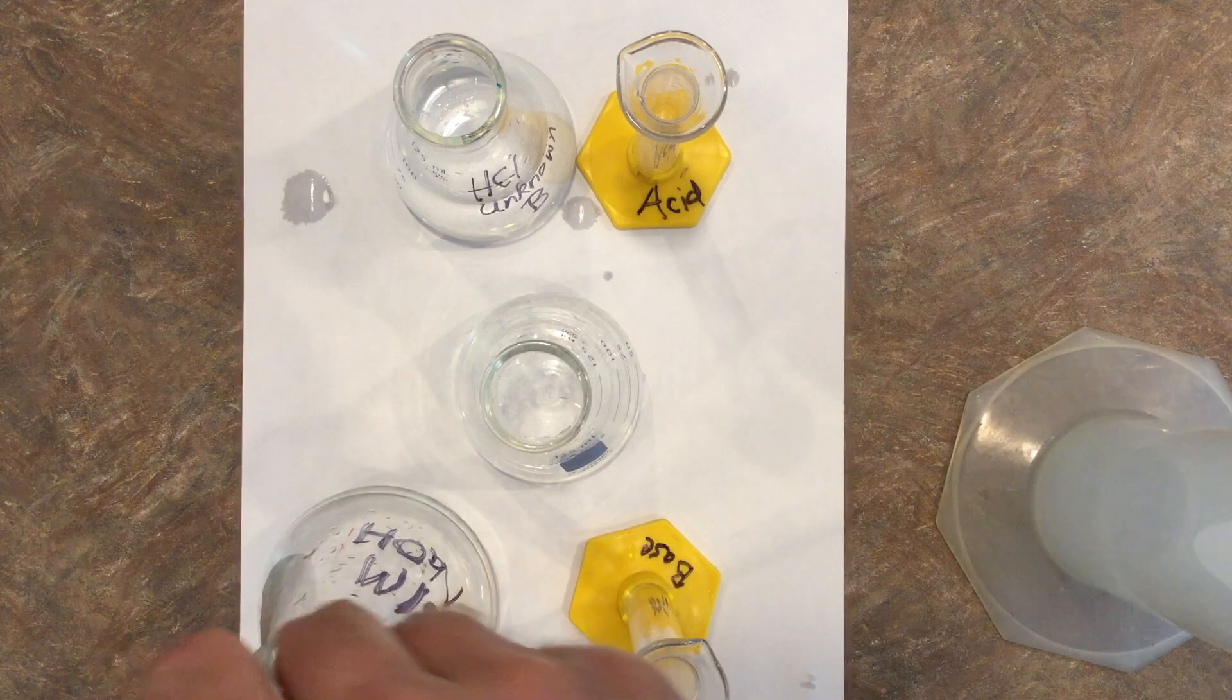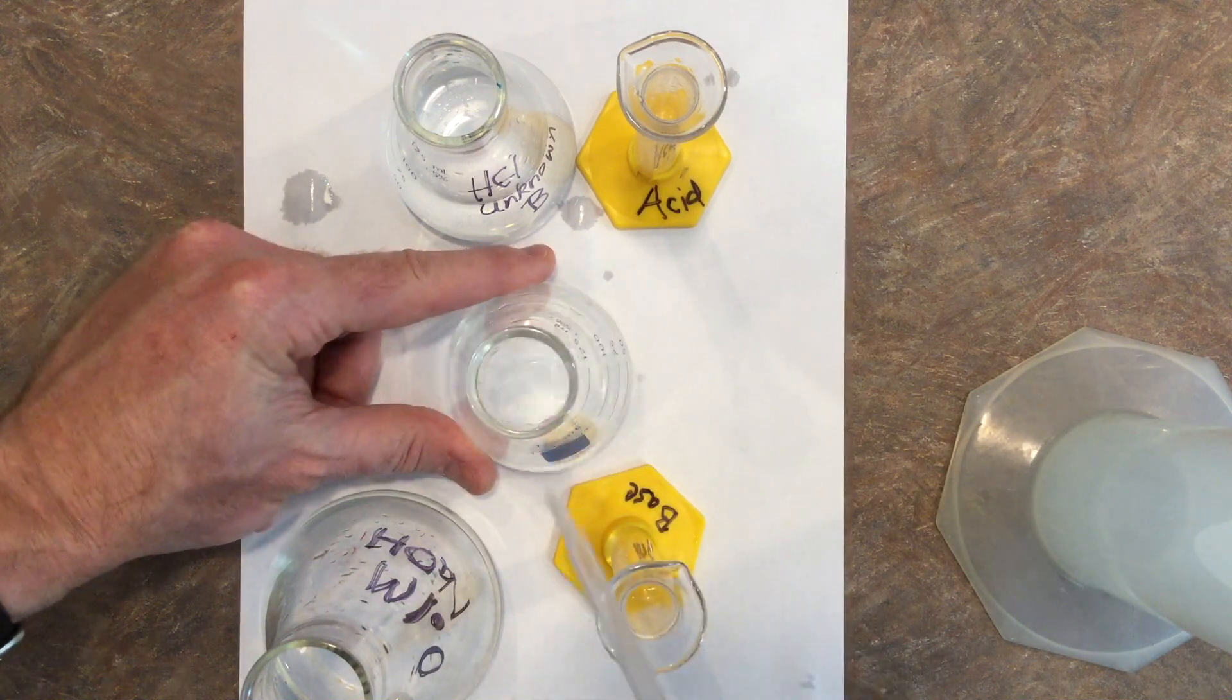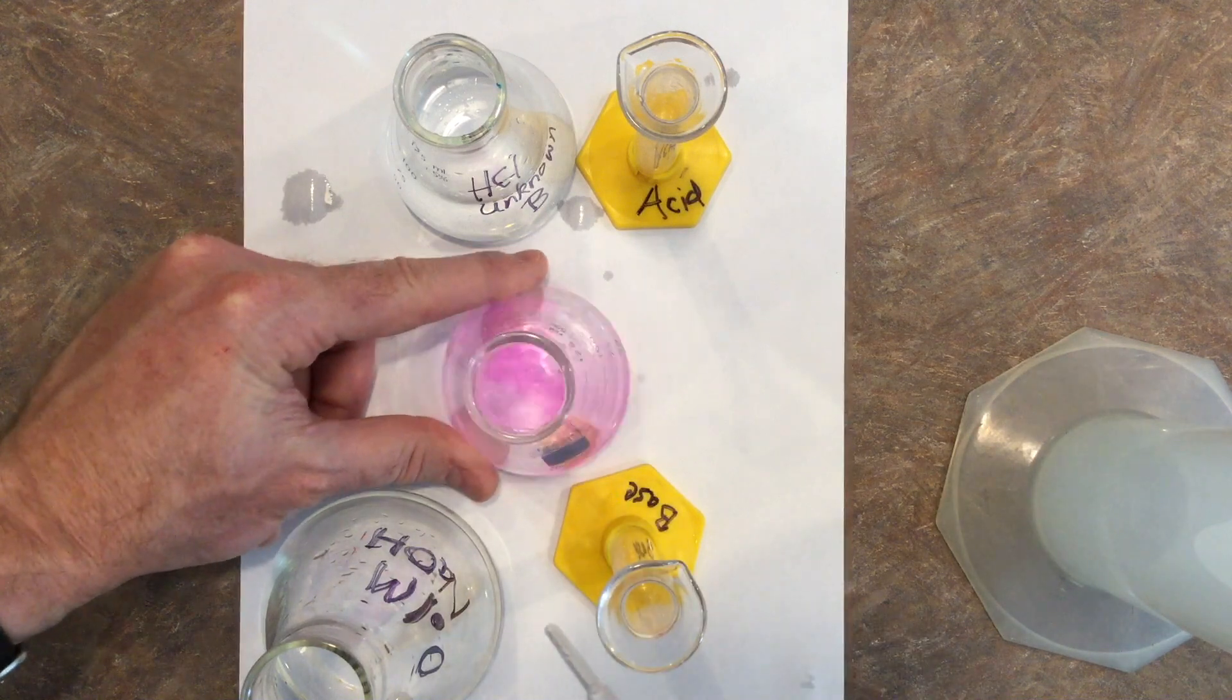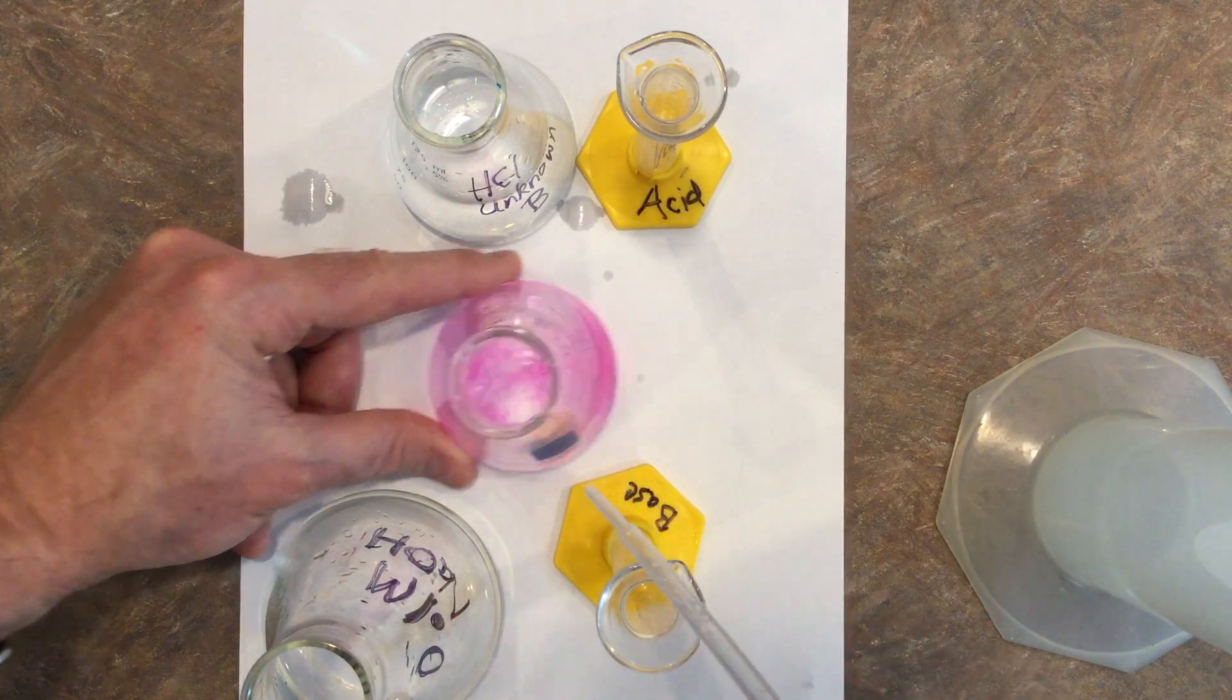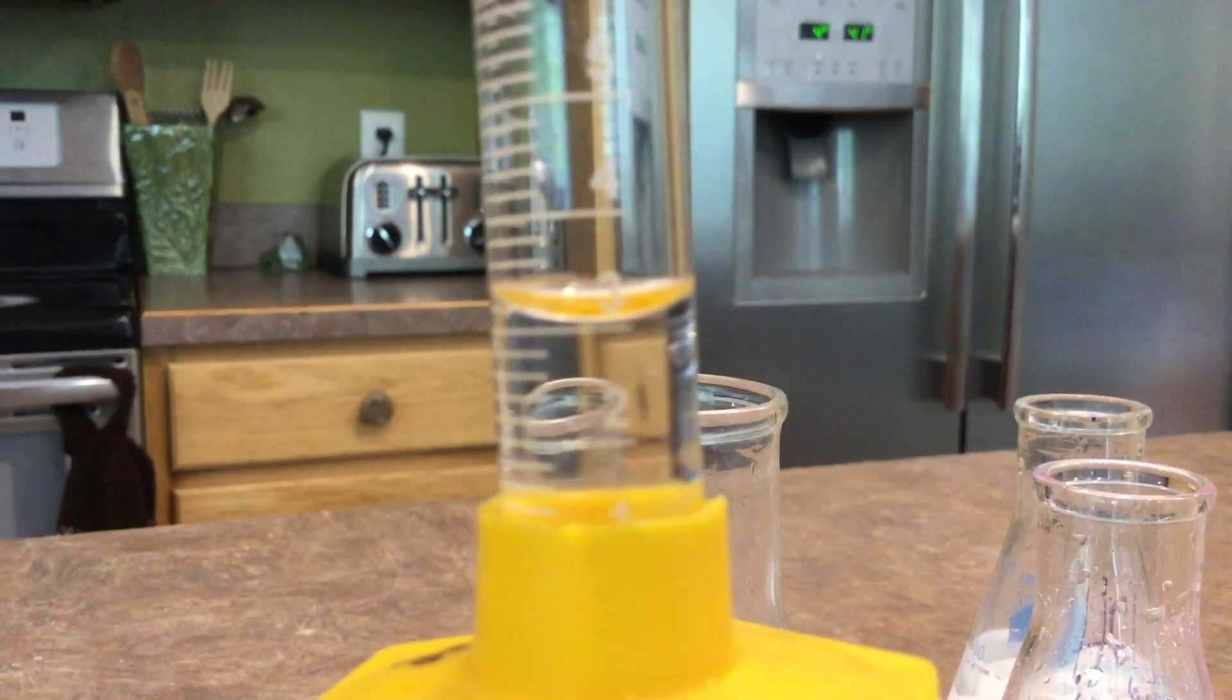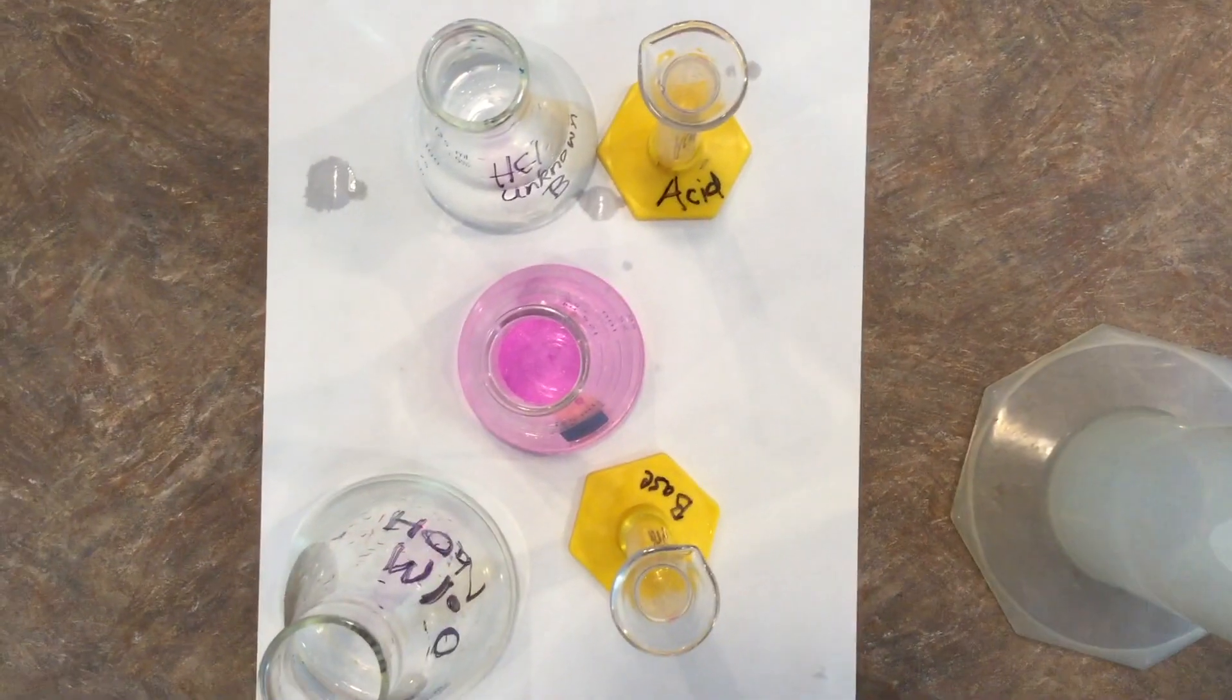Well, I've run out of my 10, so I'll need to go ahead and fill it up again. And back to slowly adding until we can get that color change to remain constant. And there it is. So when we look at the side of the graduated cylinder it reads 3 milliliters, which means we've used 7 from this one and the first 10. So a total of 17 milliliters of sodium hydroxide to neutralize the hydrochloric acid.